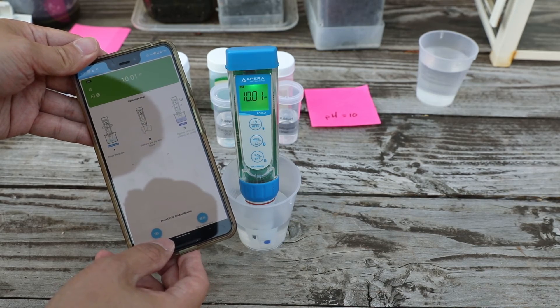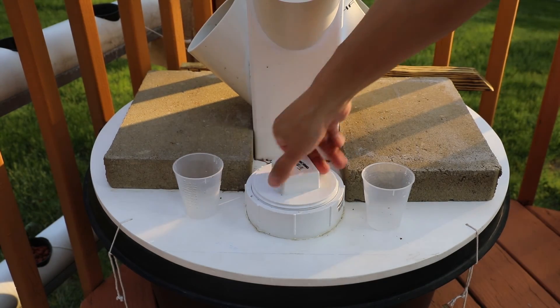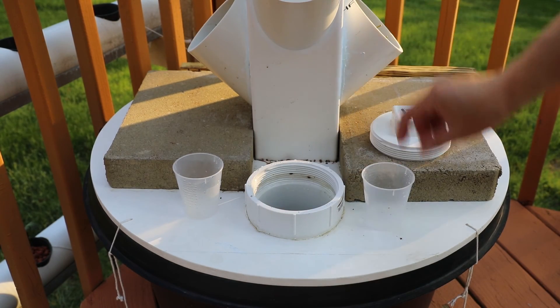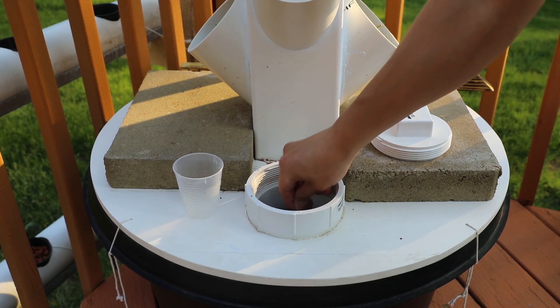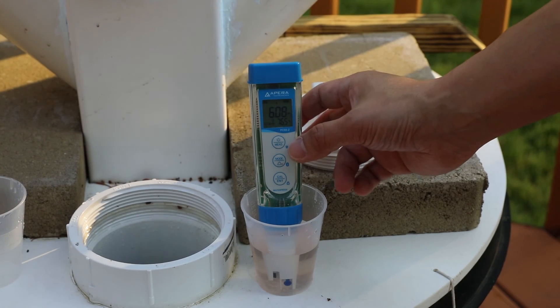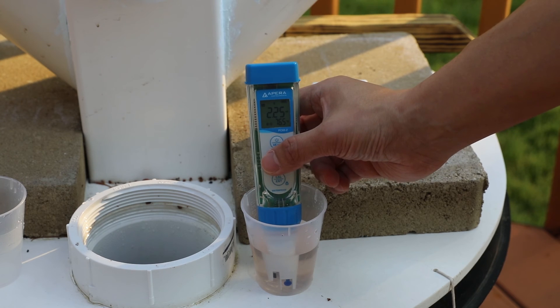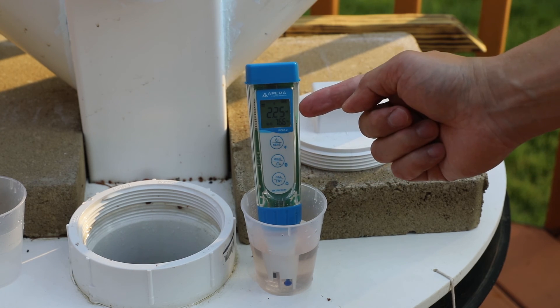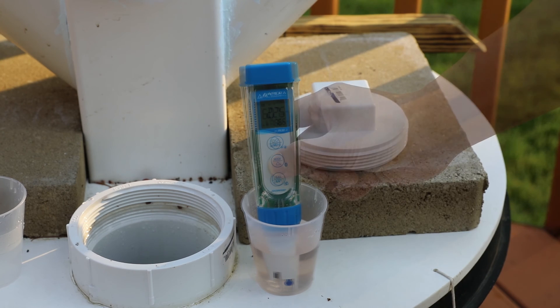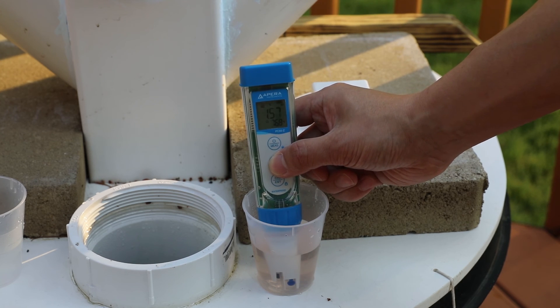After that, you're all ready and set. In my case I'm testing my hydroponic solution, particularly the pH and EC readings. Grab a little cup, insert your probe — I'm getting 6.07 for my pH and about 2.25 for my EC, which is just about right for my system. You can toggle through the measurements from pH, conductivity, TDS, salinity, and resistivity, but for my general purpose I only use pH and EC for my hydroponic system.